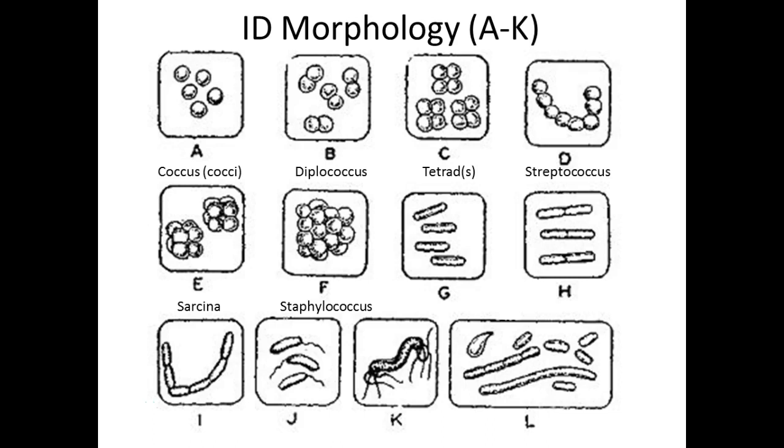These guys, the term, Bacillus. And then a lot of times we refer to these as what? Rod-shaped, right? The term for this next arrangement? Diplobacillus, or diplobacilli if you're talking about all of them. And then the next one, Streptobacillus. And this one is a rod that has a little bit of a curve to it. This is Vibrio, and it also shows what?